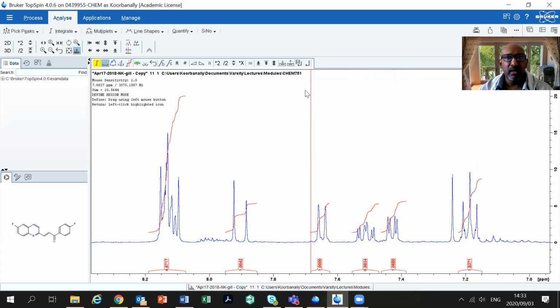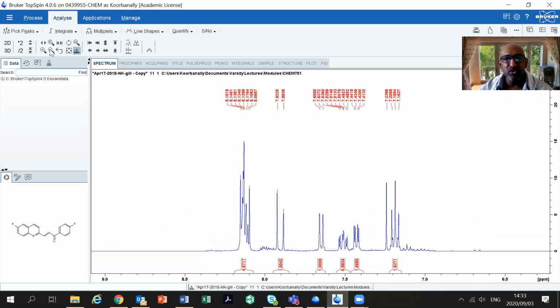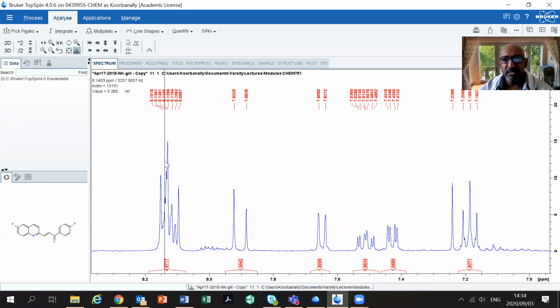All right, so I can go ahead now and save again. I've got my 11 protons here. I've got all my resonances that I can see nice and clear. I'm going to save that and return it and see what I have. Right, so I'm going back to the spectrum, and can you see now I have a nice spectrum where I can see things very clearly, and I can use these plus and minus buttons to zoom out and zoom in. You see I can zoom out here, or I can zoom in to see it a bit clearer, and that's the way we had it.